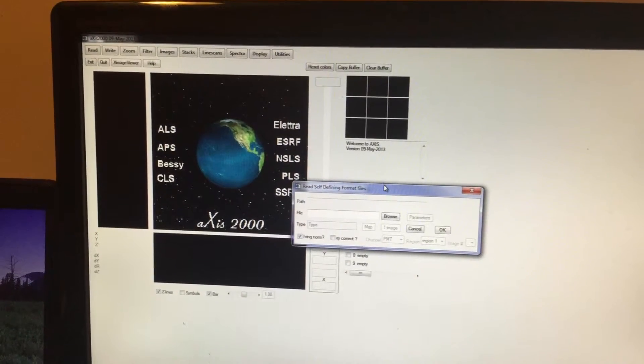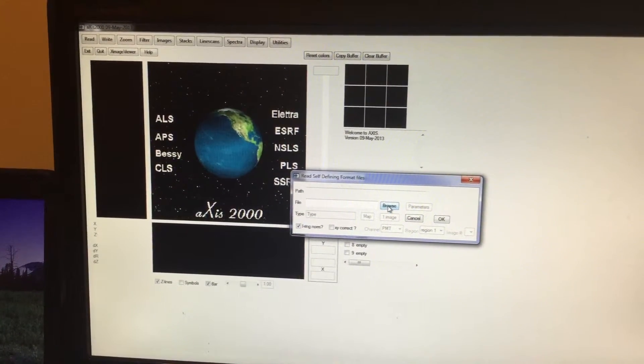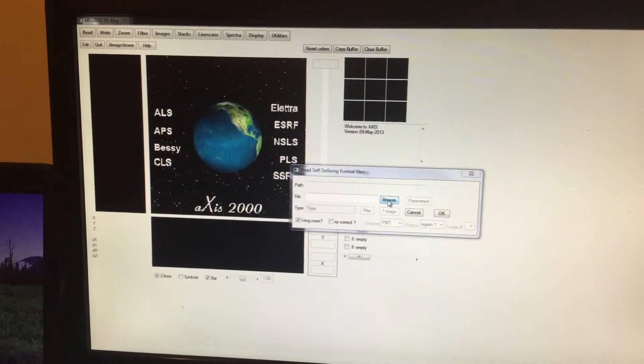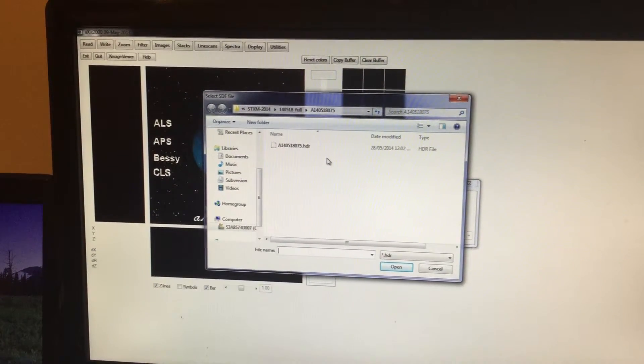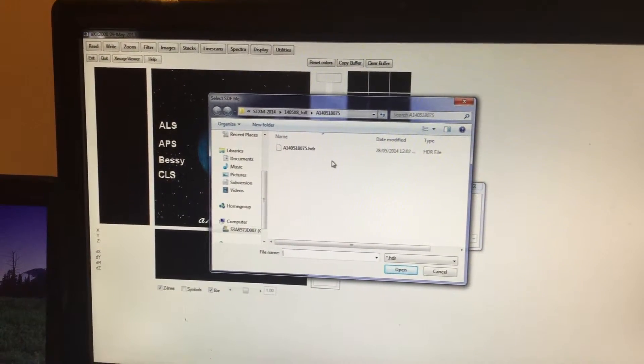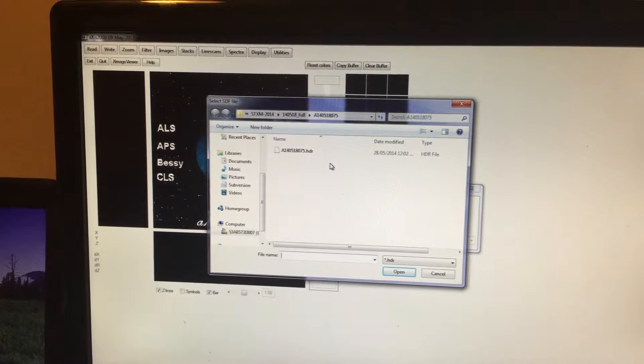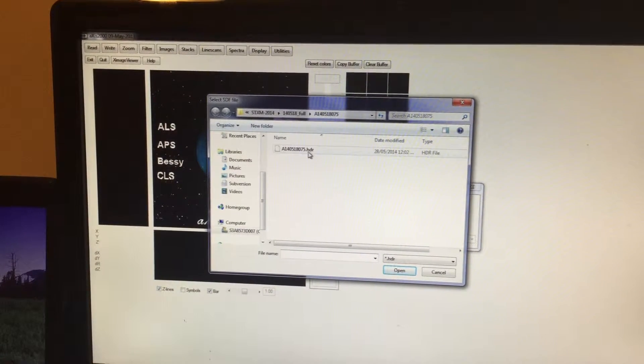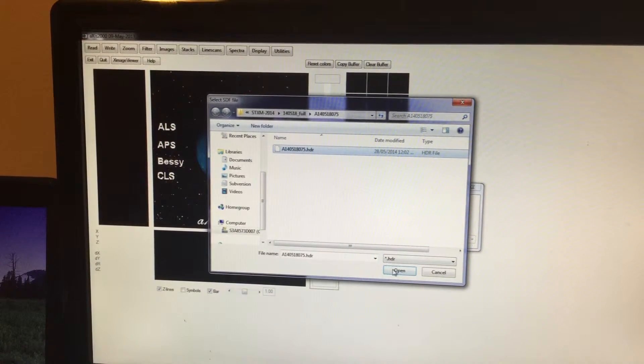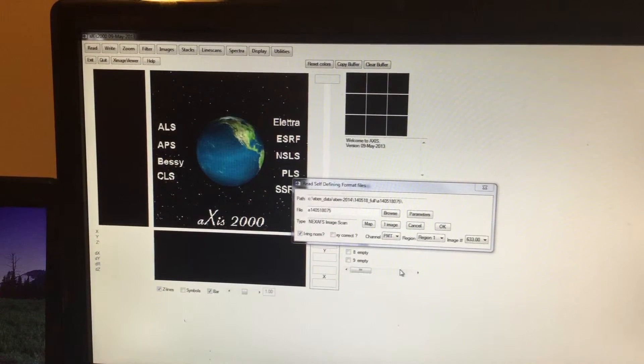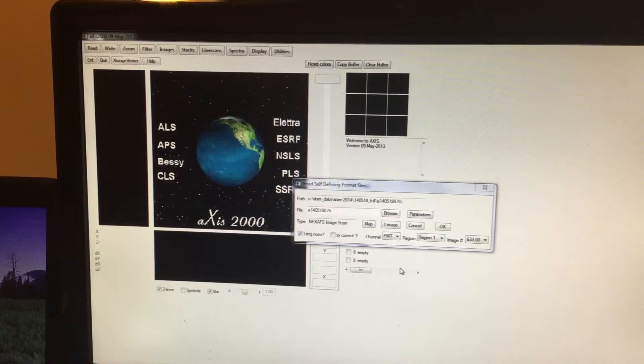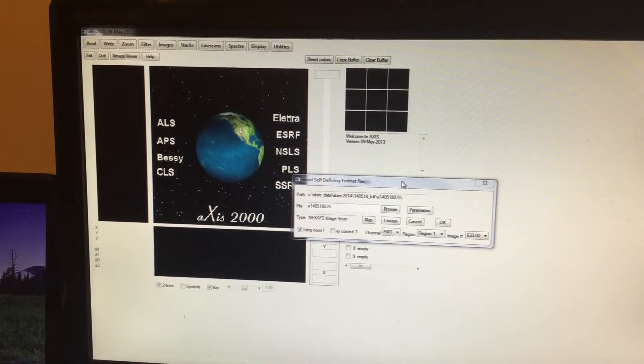This small window will pop up. You can see here Browse. You're going to click on that, then it will directly take you to the STICSUM data. You're going to click on that and click on Open.